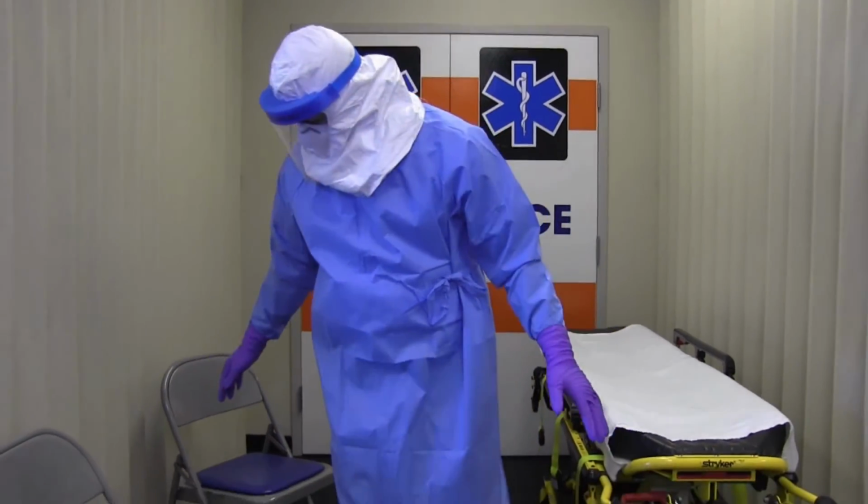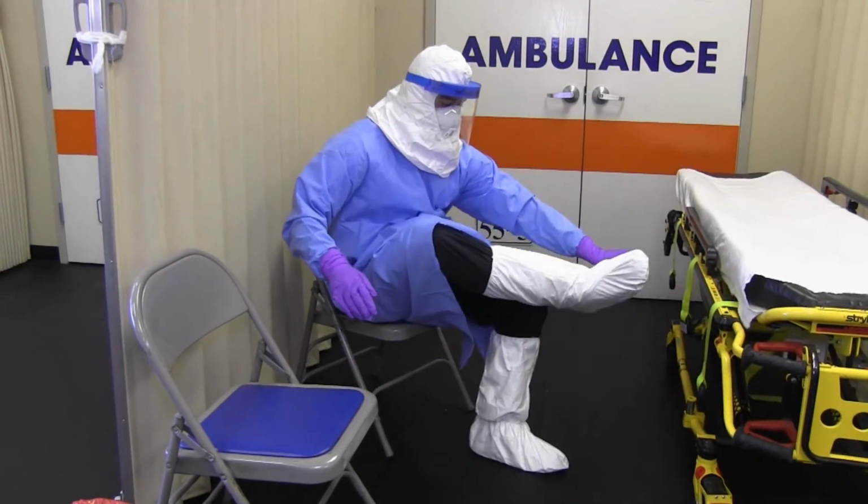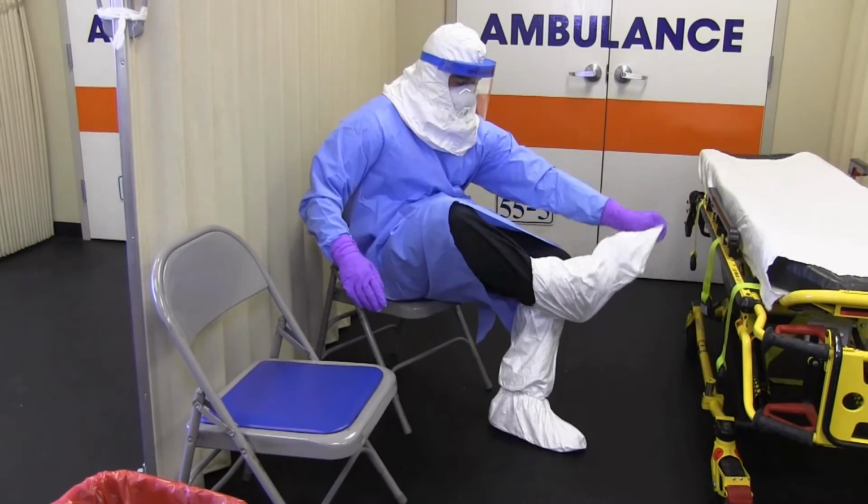You will then remove your boot covers. While sitting down, remove and discard boot covers. Remember, this seat is now contaminated, and for any future sitting, you'll need to select a different place to sit.